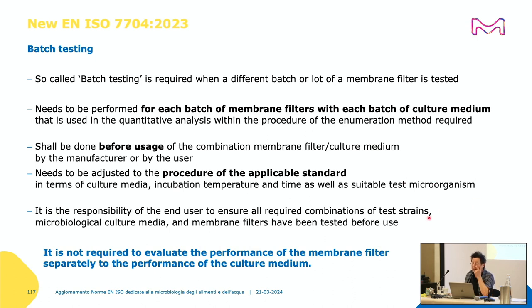So it has to be done with the same methodology as in the applicable standard for Legionella, for E. coli, for Pseudomonas, for example. So incubation is always the same as given in the specific standard. And it is also possible to buy combinations pre-tested, but it is the responsibility of the end user to ensure that the documentation and so on is done with the required test strains, microbiological culture media, and membrane filters.